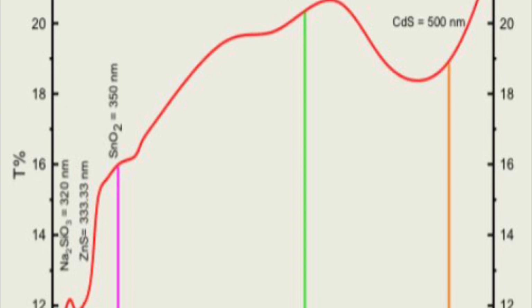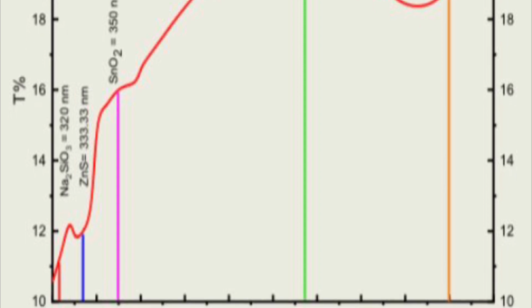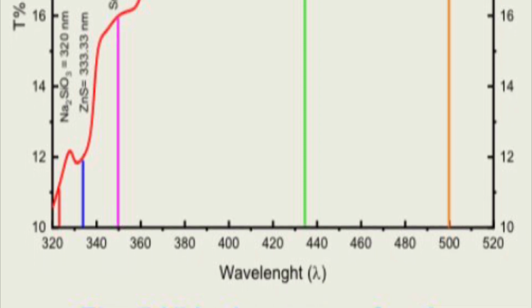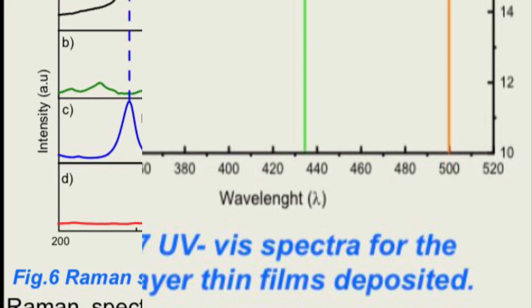Secondly, we can observe the optical transmission. This optical transmission is above 20%, something good for being used as a window layer. We can observe all the signals for the compounds synthesized, and we can achieve a good optical response.